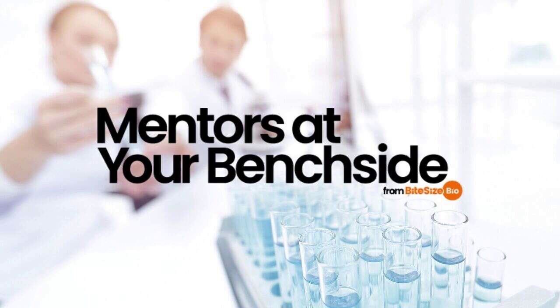I'm Laura Grassi, and today I'll be talking to you about how Ponceau S staining can help troubleshoot your Western blot problems. You know how many problems can crop up if you routinely perform Western blotting. Ponceau S staining can help identify issues early on, saving you time and effort in incubating and developing bad blots. In this episode, we'll cover how Ponceau S works, how to perform staining, and give you an overview of how to interpret what the stain means when troubleshooting your failed blots.